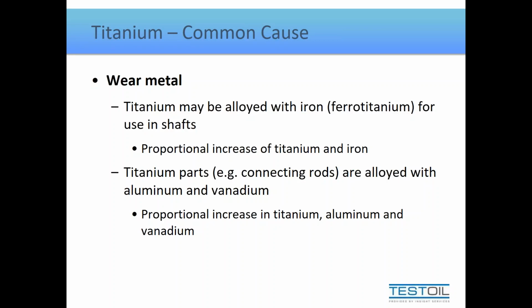So again, why I stress at the beginning that one of the fundamental things about this test is that it is measuring the elements and the elements only, is if we measure titanium and we measure vanadium, we can't tell if those are coming from an actual metal part or if they're coming from organometallic additives found in oils and residual metals found in crude oil.